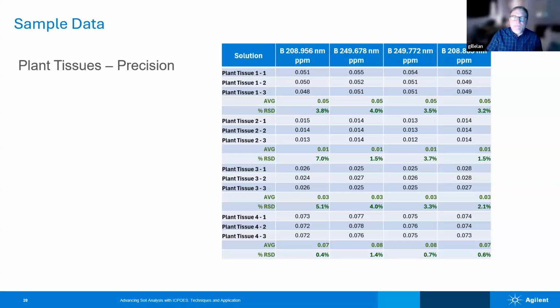And I don't think people have enough of an appreciation for peristaltic pump tubing and the amount of punishment it takes. I think that is the Achilles heel of the ICP, and if that is not right, bad things are going to happen. You need to learn how to tension it properly.